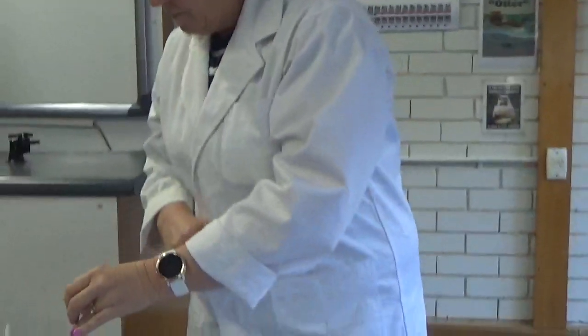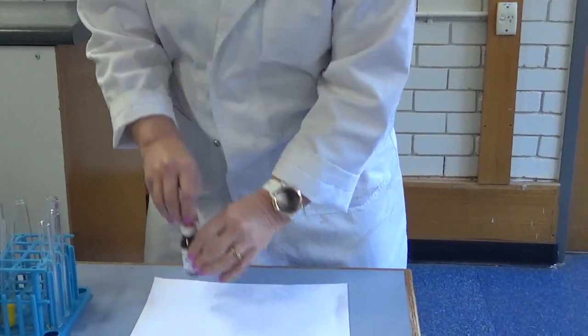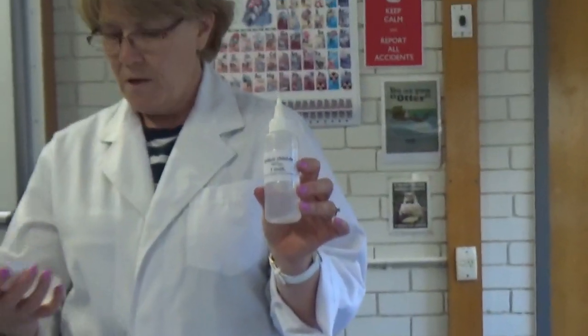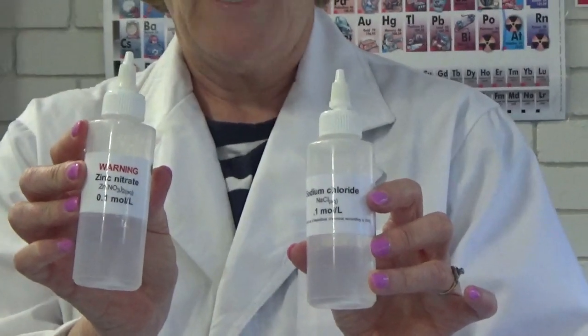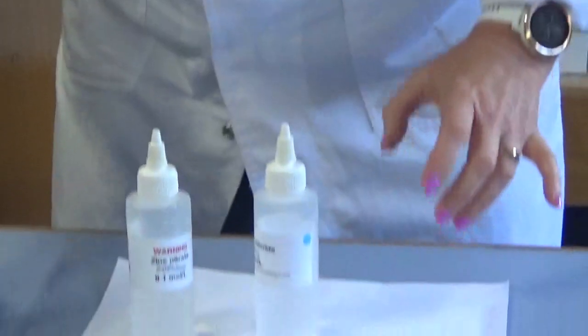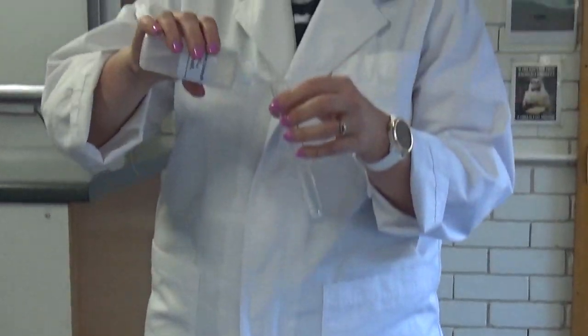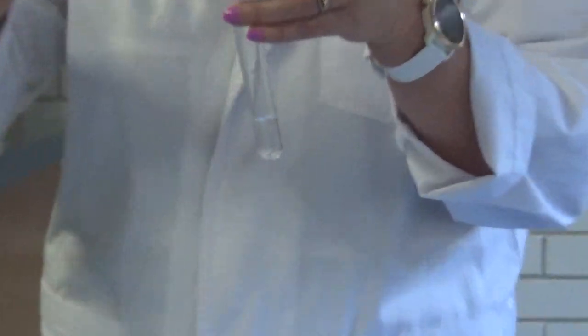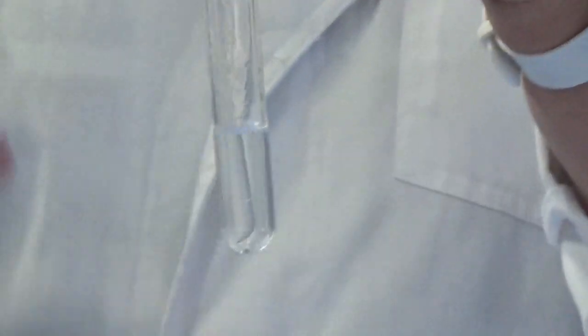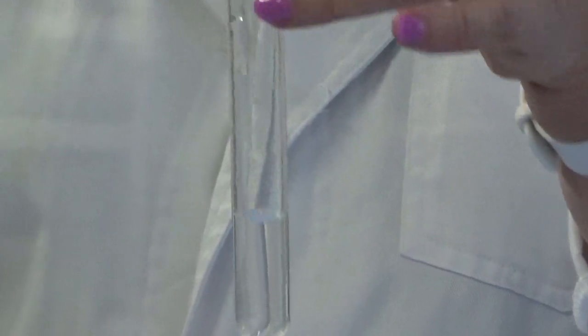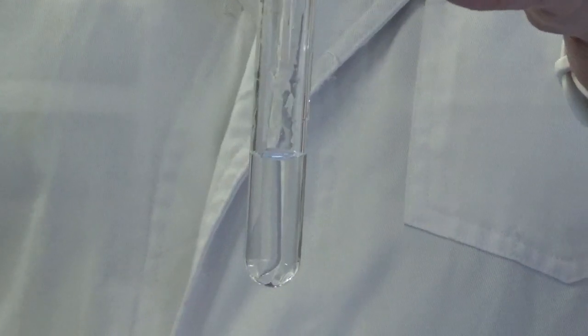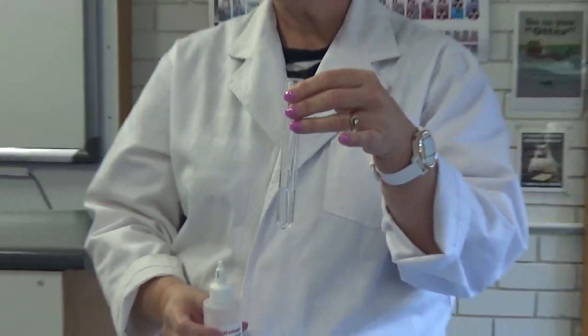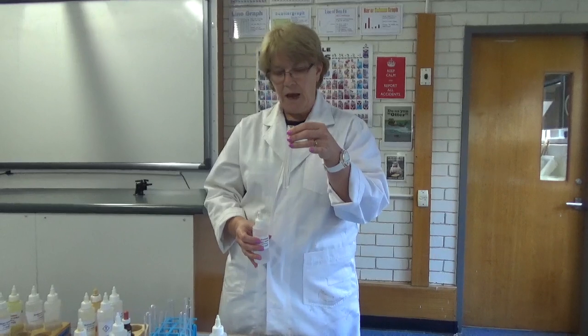Alright, let's try another one. Let's try some sodium chloride. Sodium chloride is just salt and we're going to put that with some zinc nitrate. We're going to see what happens with those two. Nothing. See, it doesn't happen all the time. So sometimes you get a precipitate and that shows the chemical reaction happened. Sometimes you don't get a precipitate.